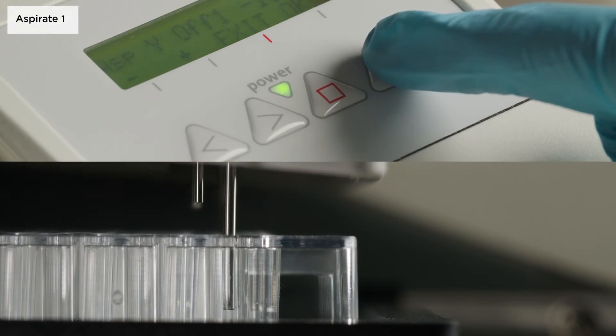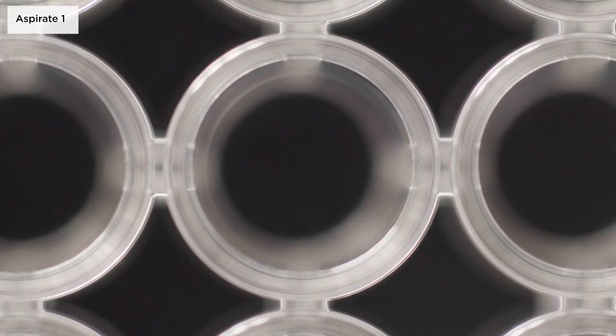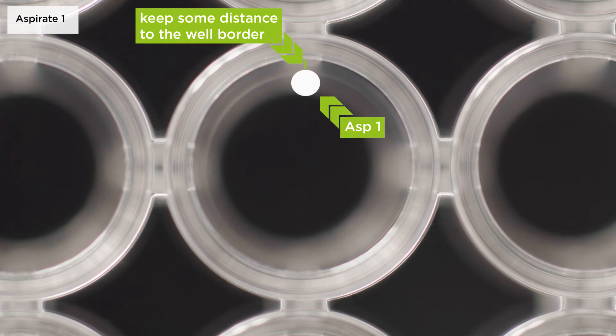The aspiration one position is available for all plate types. For flat bottom plates, the aspiration needles are typically positioned at the back of the wells. Make sure to keep some distance to the well border to prevent drops remaining in the well or the needles hitting the plate.